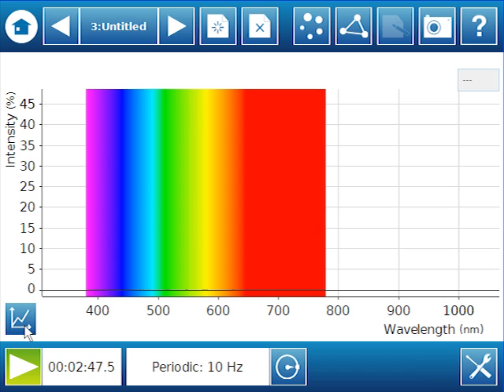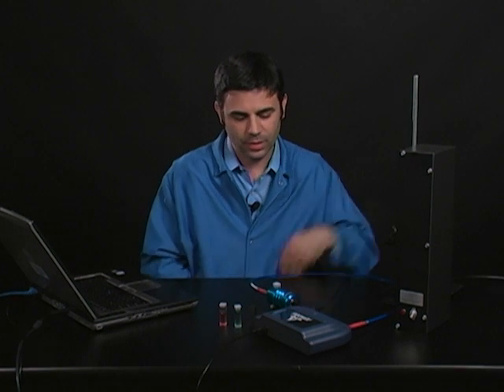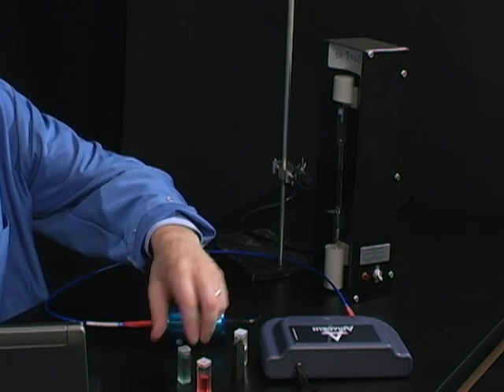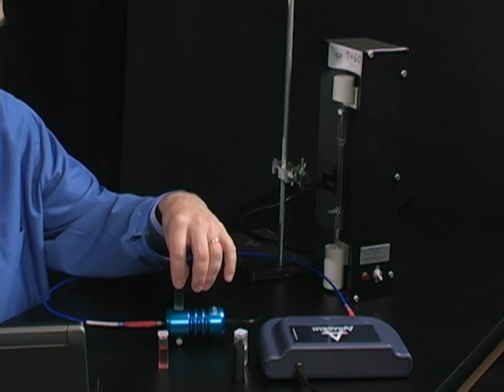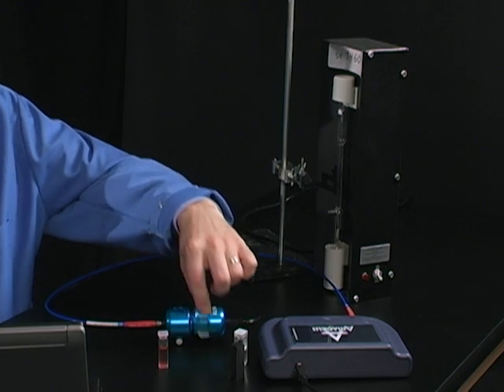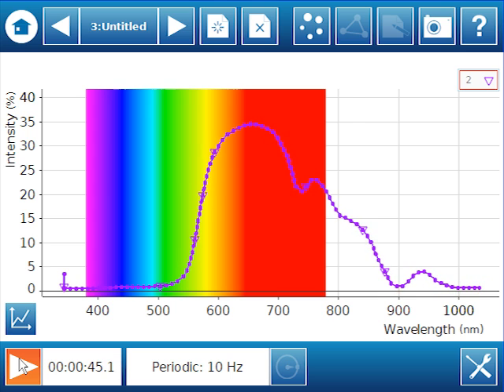And I'm actually going to start with the water in here just to see what's happening. And we get a broad spectrum, not a line spectrum like helium because this is actually the spectrum of the light bulb that is used in the light source. So now if I look at my samples, I can see what's happening with these. So this is a green sample. And if I put this in here, it looks like there's lots of red intensity. There's a dip in that sort of red-orange area and then there's some more green. And that's primarily what we're seeing is the green. And if I put the red sample in here, now again, the shape of that curve changed. And now it's absorbing all of the sort of purple, blue, green, and it's letting through lots of red.